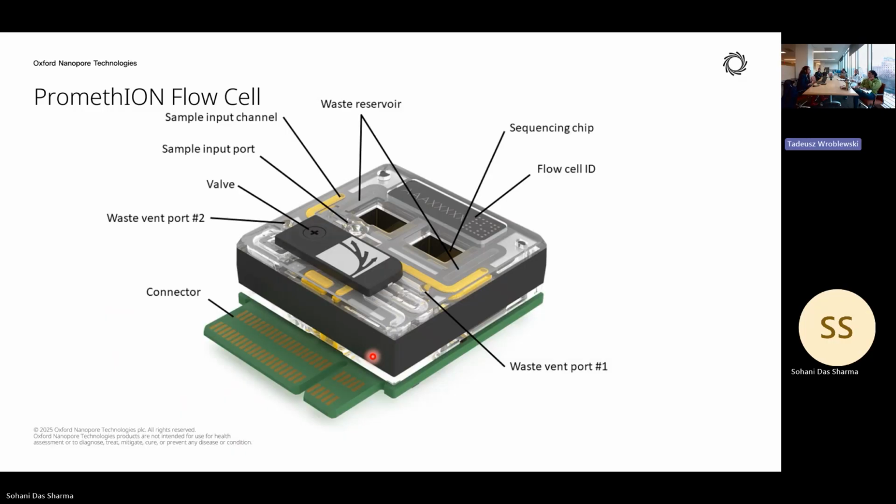Because if you don't, then when you are doing the de novo assembly, you have to stitch it computationally, and we don't want to do that, because on our platform you can actually get a really long N50. But that is not applicable for cfDNA.